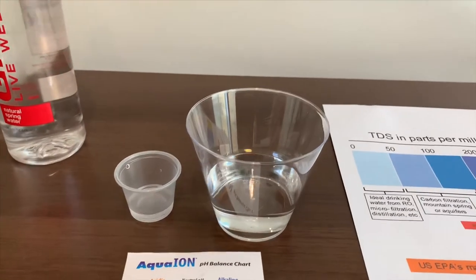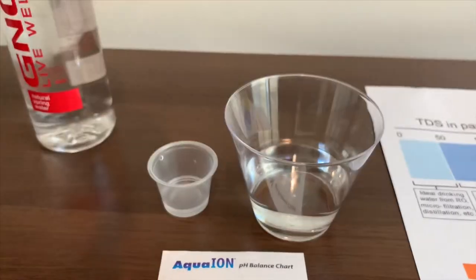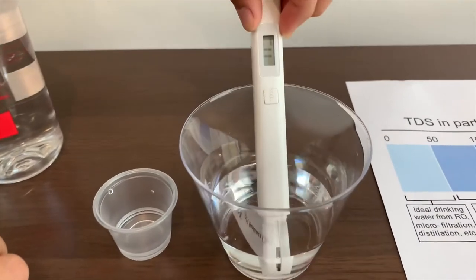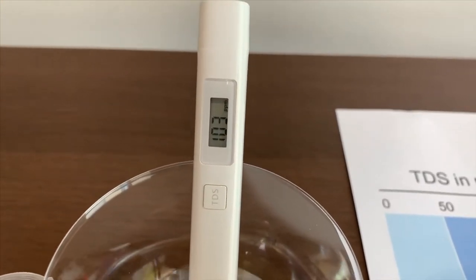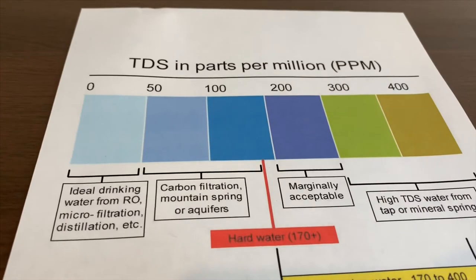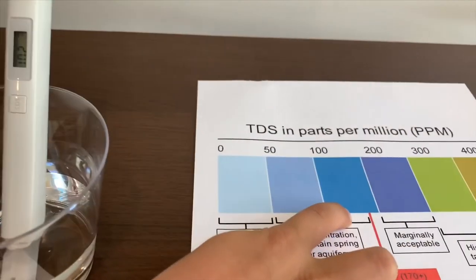Turn on the TDS tester. Make sure it says 0 and put it in. It says 102. That is okay.